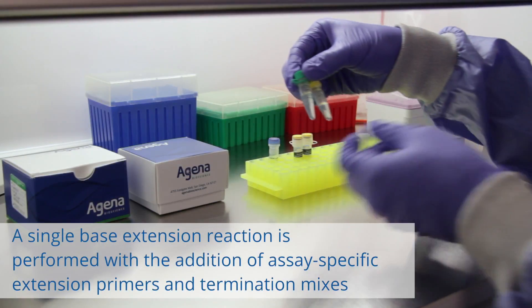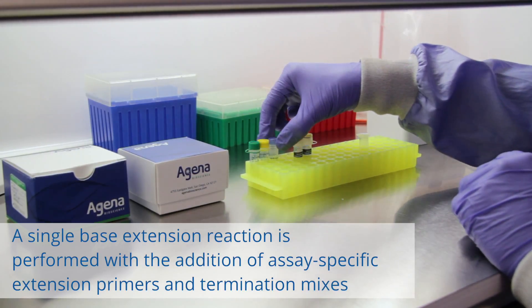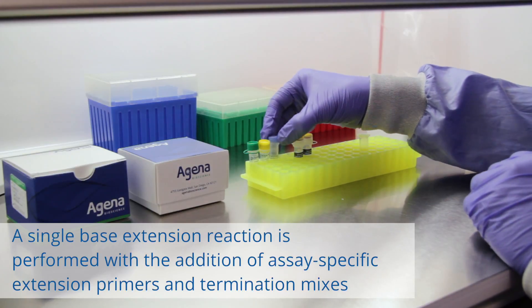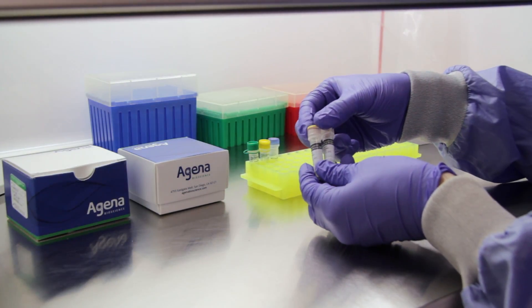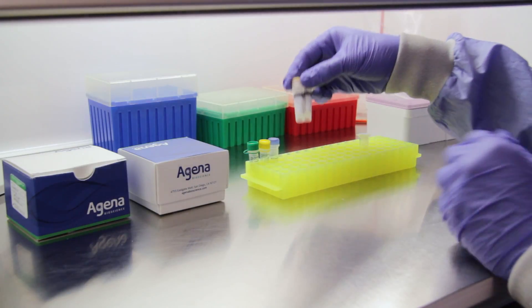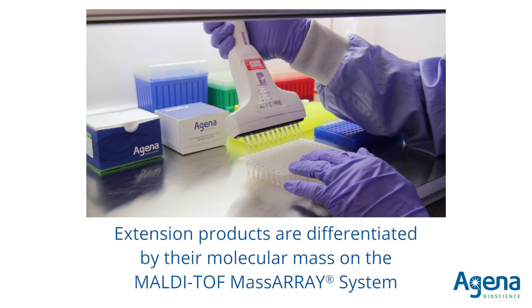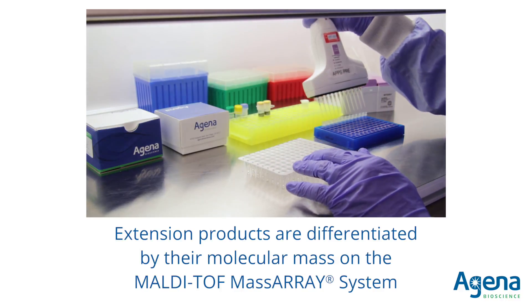Next, a single base extension reaction is performed with the addition of assay-specific extension primers and termination mixes. The extension primers anneal adjacent to each variant site and are extended and terminated by a single complementary base. This process ensures that the extension products can be differentiated by molecular mass once analyzed on the MassARRAY system.